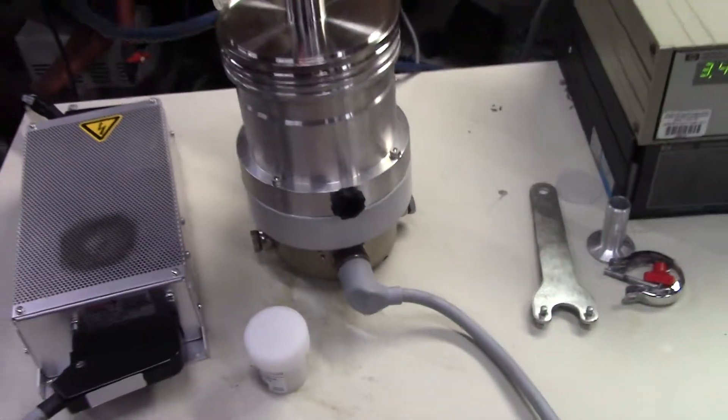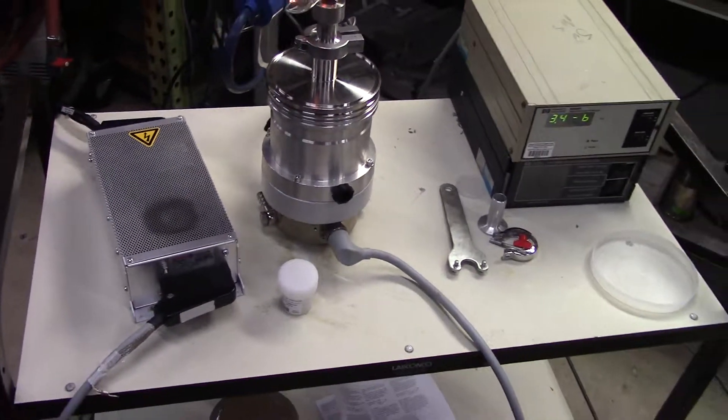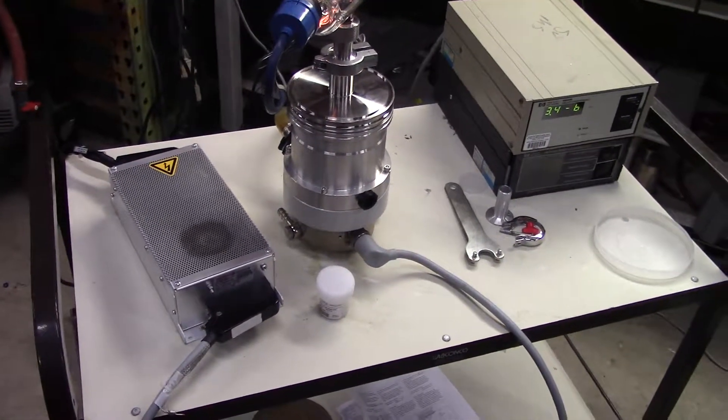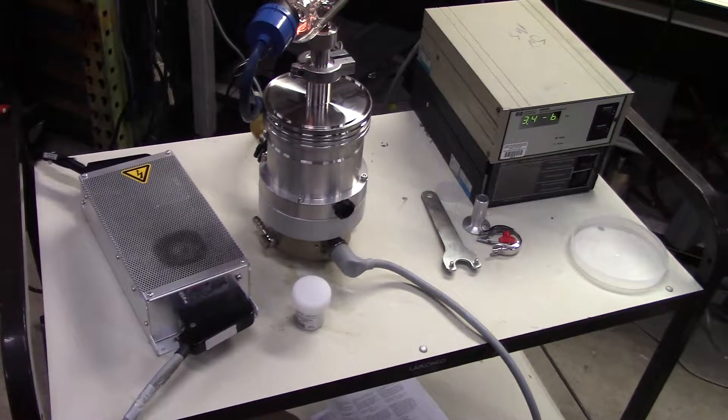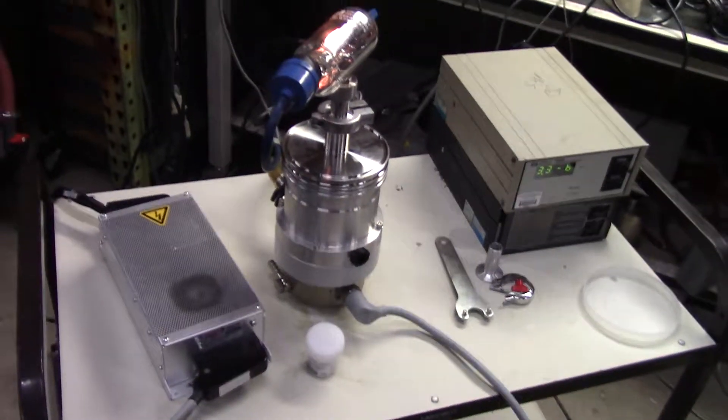I can talk to Mike Nato at HitechTrader about what sort of warranty, if any. But it is tested and working. We're going to test these things individually and put them up for sale.